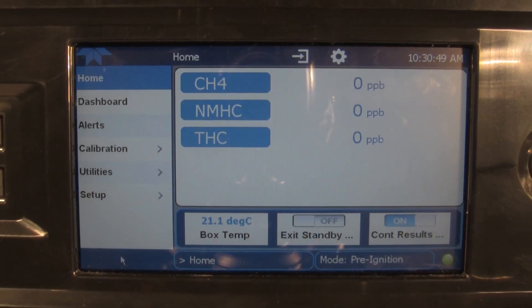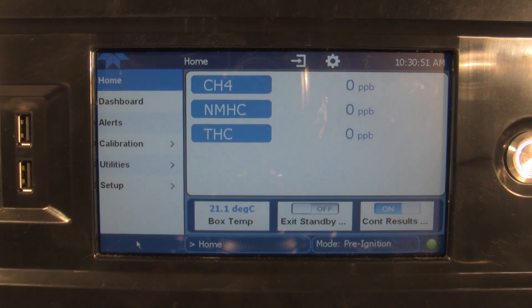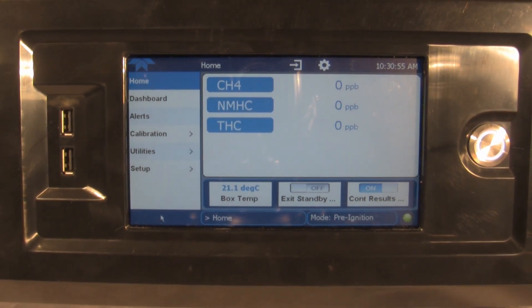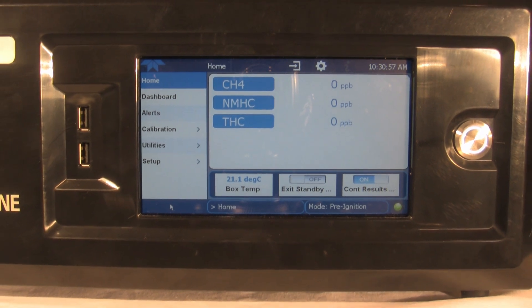The built-in Numaview interface requires no external PC to operate and provides access to all instrument functions, including chromatograms.